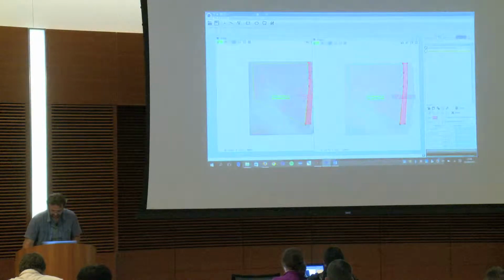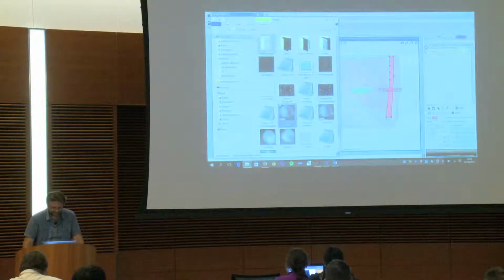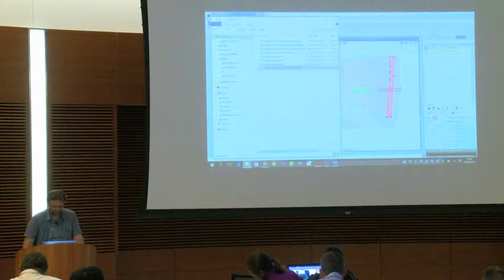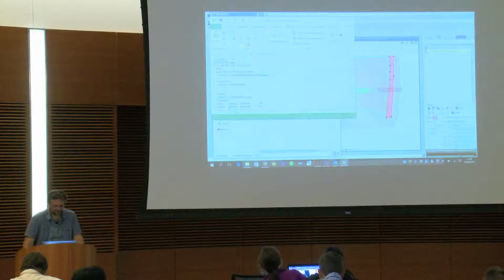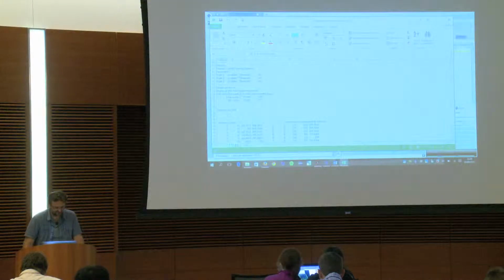Well, I'm sorry because I left this thing. So here I go in my image folder, and if I take my p7.xls, here I have automatically the result that have been saved.